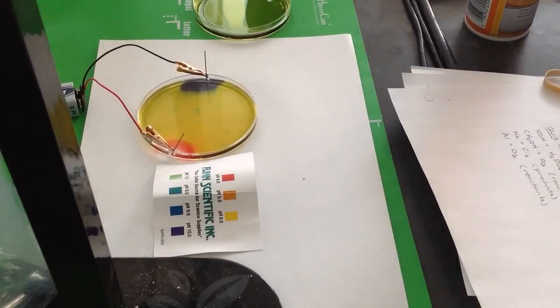So this is kind of cool. The cathode, we got 2 different things going on here. That's what's going on right at this one right here. No, this is the cathode, which is counterintuitive, right?